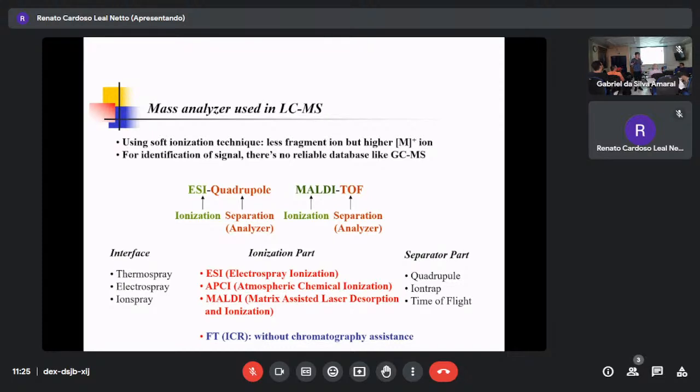So it's very soft ionization. But sometimes when you are doing lipid material, like fatty acids which are not soluble in water, then it's not enough. Even when they pass the nozzle, they are not ionized, because water or methanol does not help to make them ionized. In that case, there is a corona. Have you heard about it?